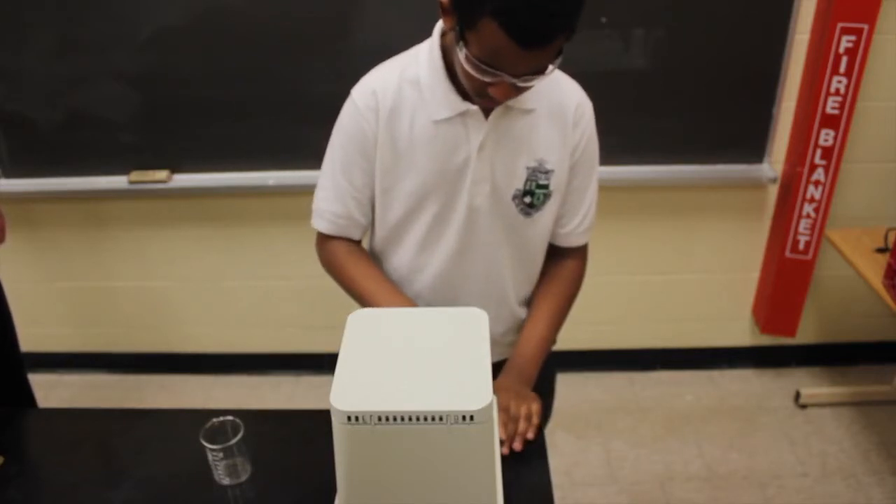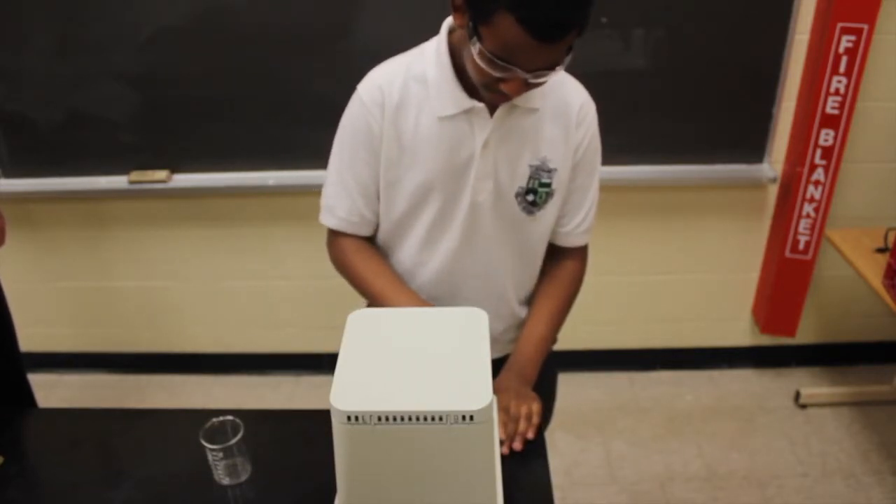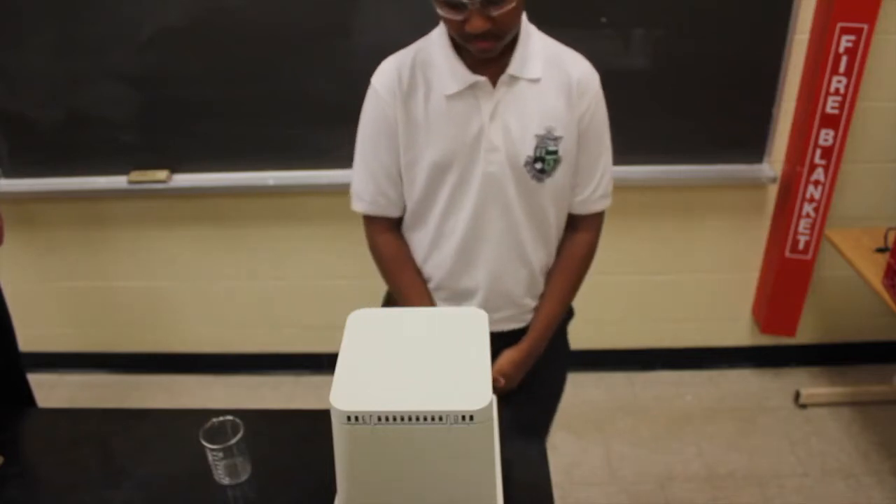Also, a centrifuge should always be given time to stop on its own, as you should never stop it with your hands.